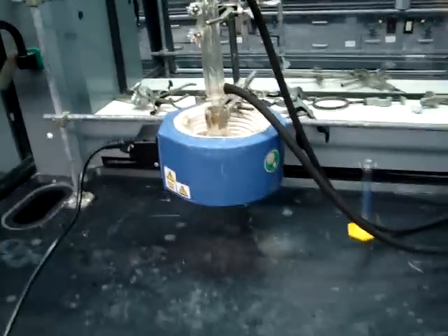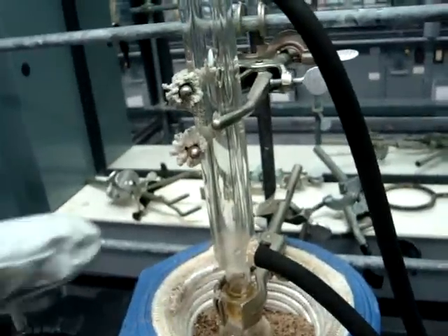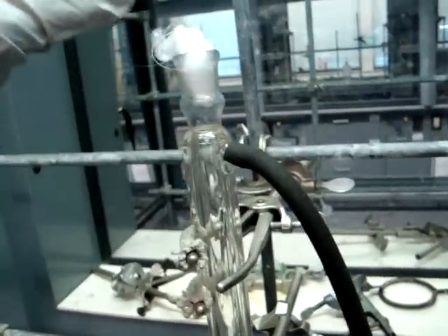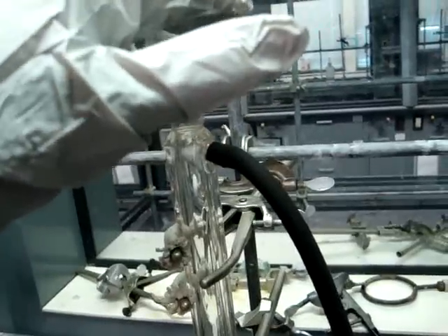You will also want to add boiling chips to the round bottom flask. You will set up your reflux system as you have done in the past, with your water in on the bottom and your water out on the top. You will also want some wool into the top of the condenser to make sure that none of your vapors will escape.